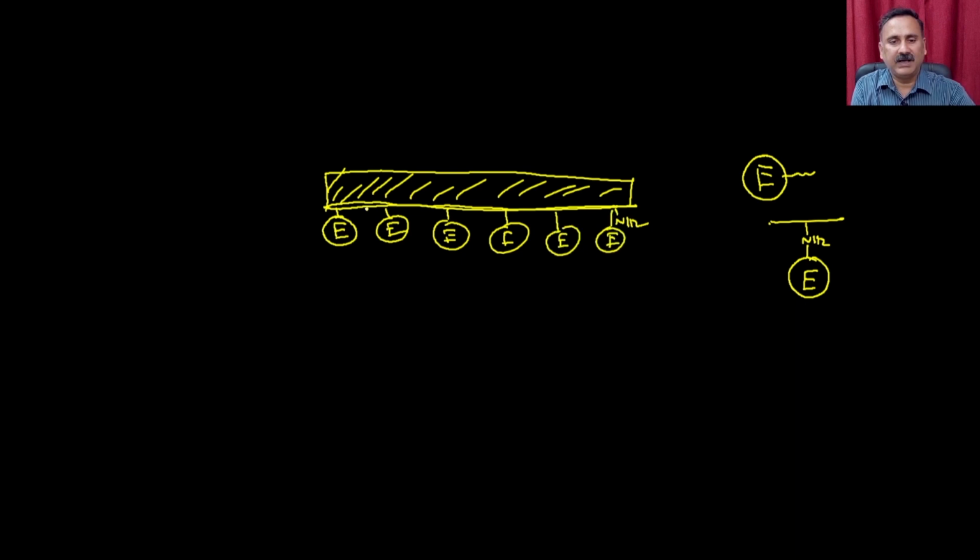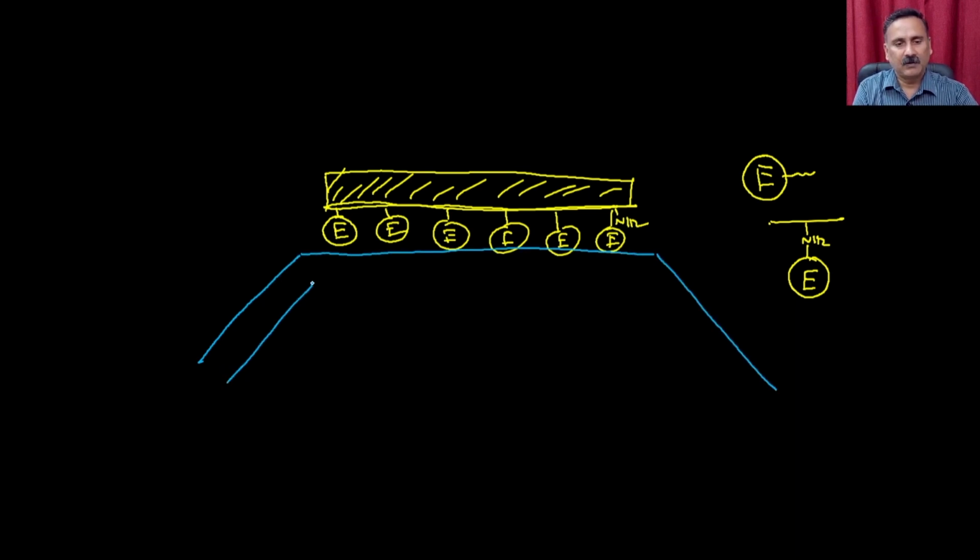With the help of any kind of conjugating material that is present, what I am going to do is have the system, so I can actually have micro channels. I can have the micro channel like this, and in this micro channel I can flow the liquid. So this can go like this.